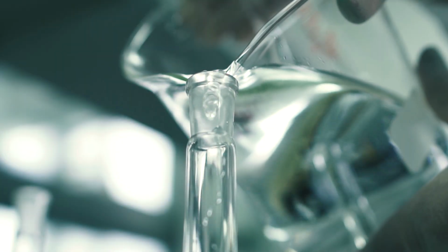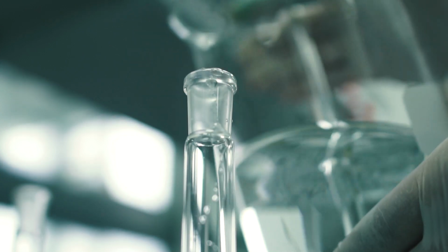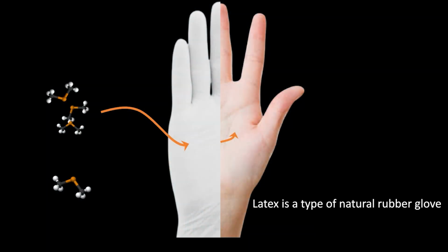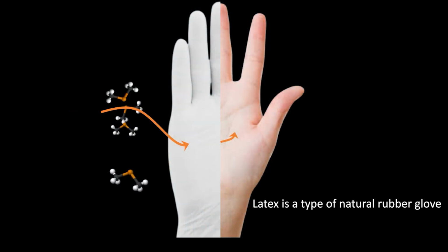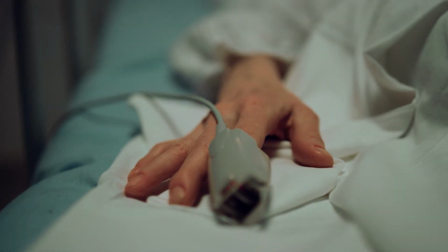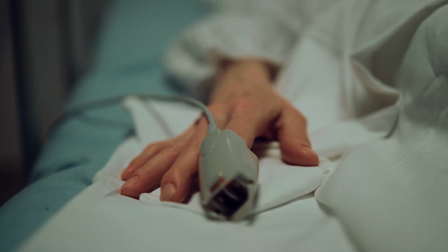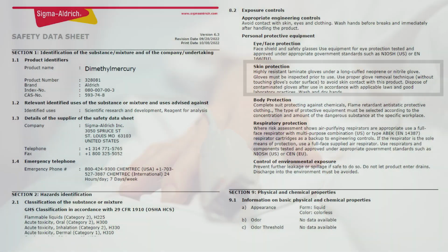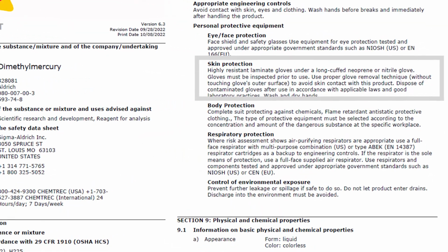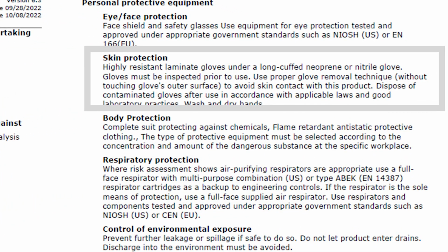Since the chemical was clear like water and hadn't burned or otherwise deformed her gloves, she didn't think there was any reason to panic. But the chemical had permeated through her latex glove in less than 15 seconds and seeped through her skin. Latex gloves were later found to be terribly insufficient for working with this extremely dangerous chemical. She soon began experiencing progressively worsening signs of mercury poisoning, which eventually led to her death. Post-accident glove testing results showed that pairing silver shield with neoprene gloves was the only guard against dimethylmercury.